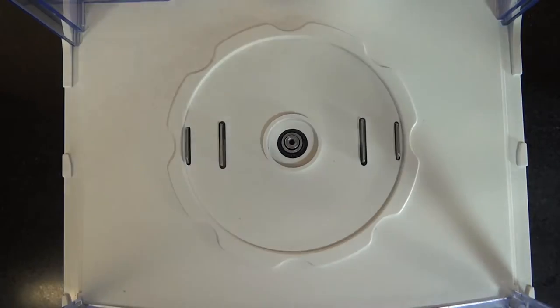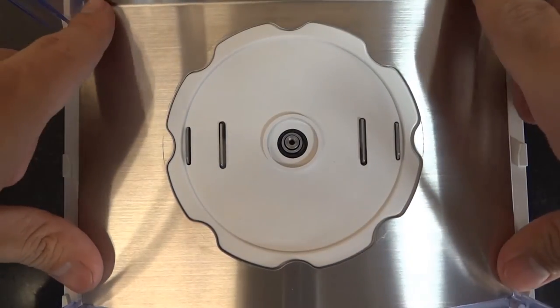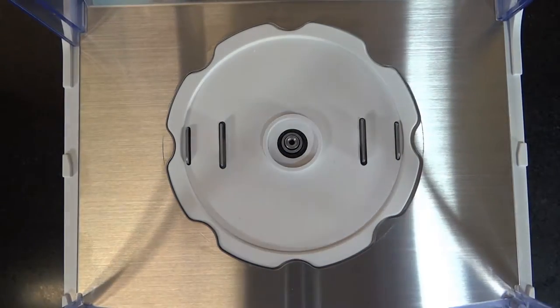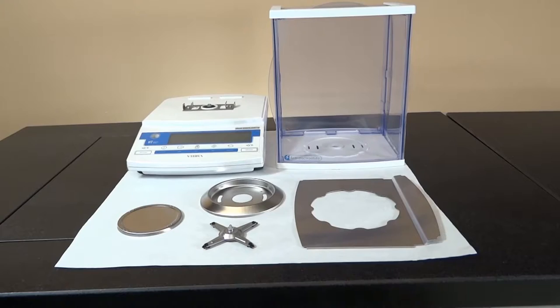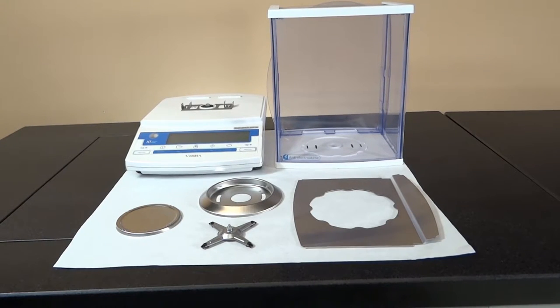The weighing chamber's floor is lined with stainless steel and fitted with a spill ring to prevent contamination from entering the housing. Each piece, including the weighing chamber doors, can be quickly removed, making cleaning easy.